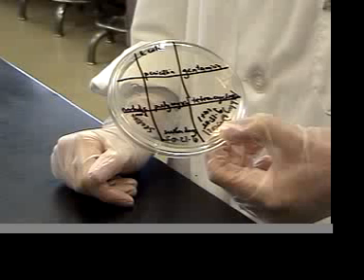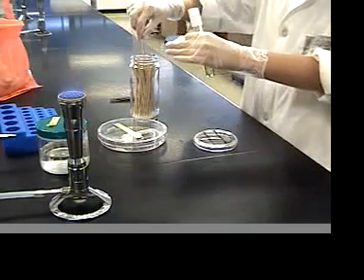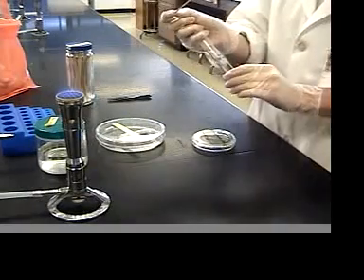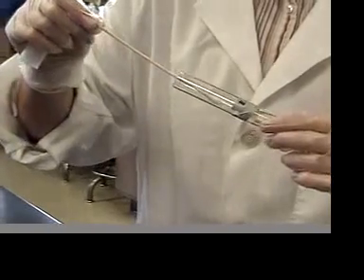The Kirby-Bauer technique allows us to determine the sensitivity of different bacterial strains to different antibiotics. First, in order to do this assay, you'll need to confluently inoculate an agar plate. A special agar is used called Mueller-Hinton agar.